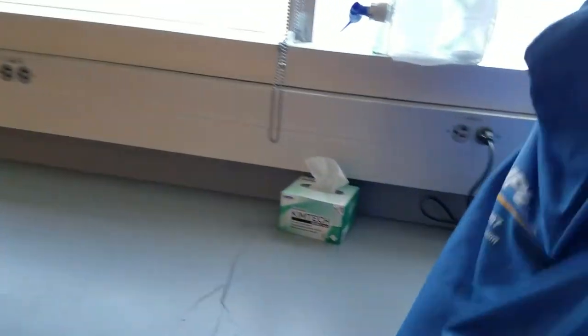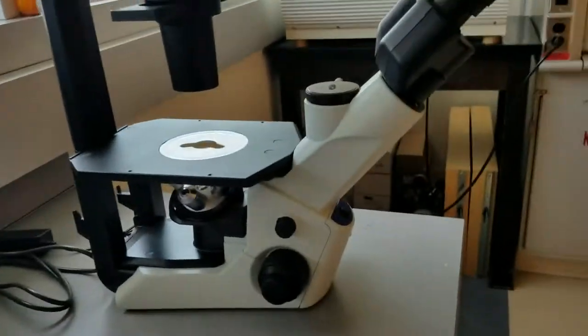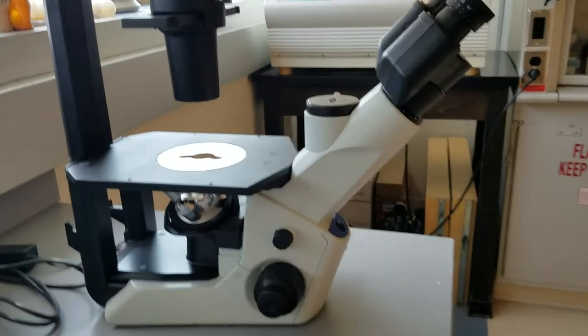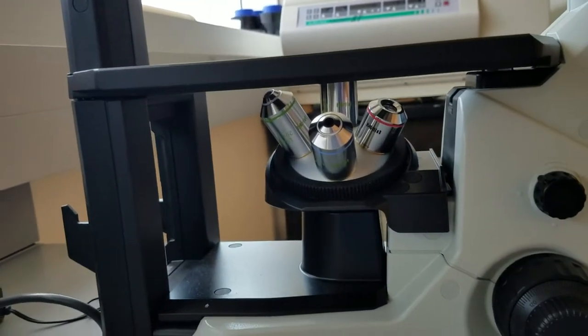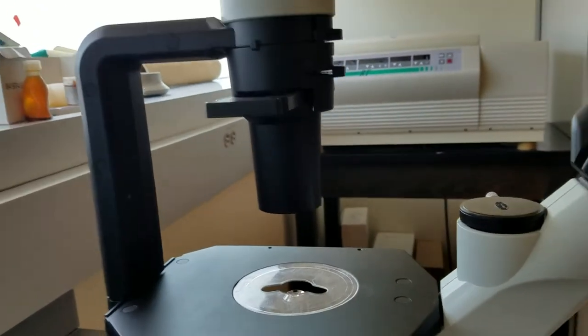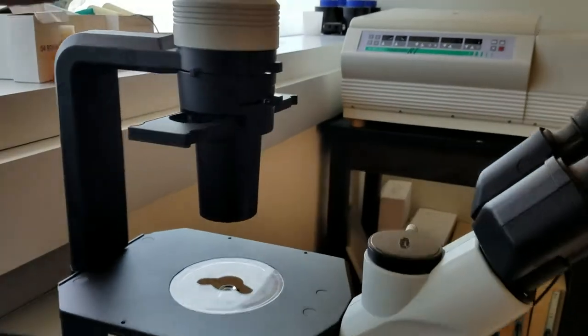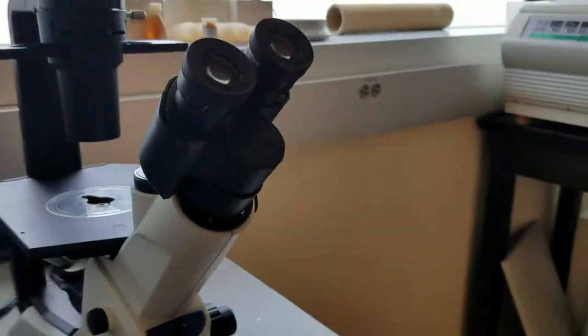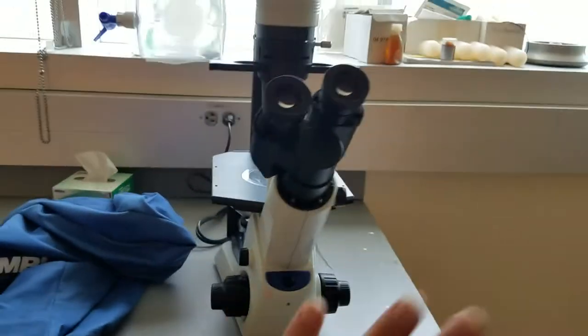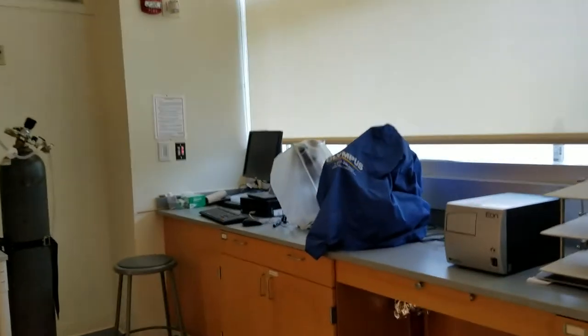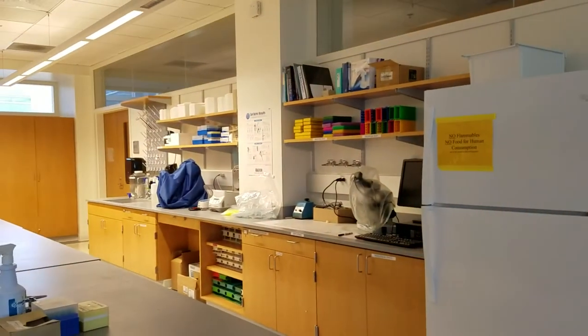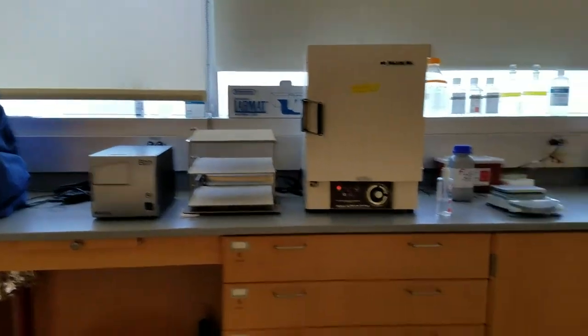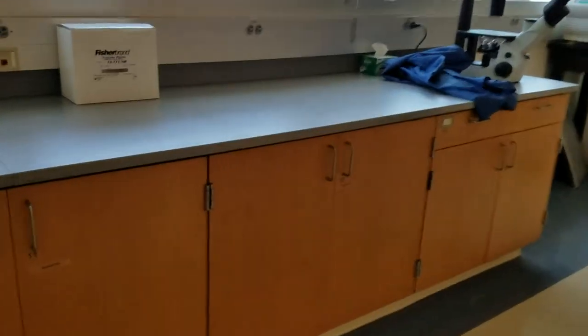We have some microscopes - there are three of these inverted microscopes. These are called inverted microscopes because you have the nose piece underneath, and this nose piece underneath allows us to look at cells that are attached to the surface of our vessels with the media on top. The light source in this case is on the top. We use this to look at our cell culture. We have three of these, all of them have this blue cover. This also allows the students to kind of divide up between the different areas and not get one area too filled up.